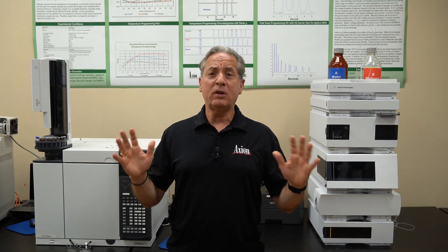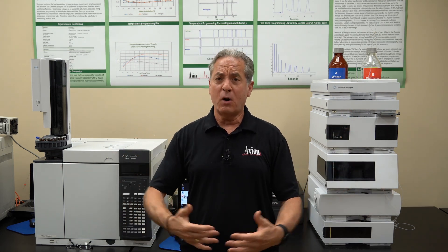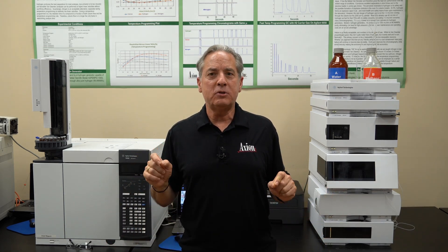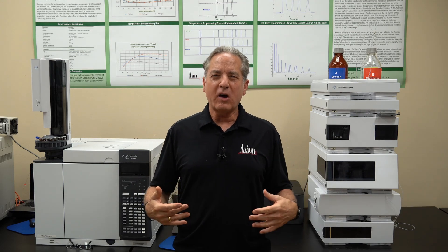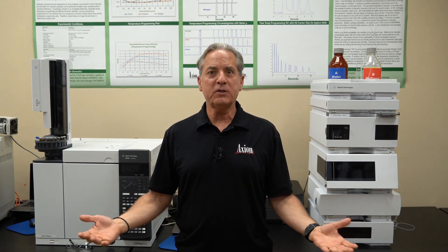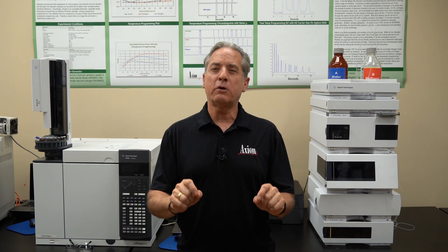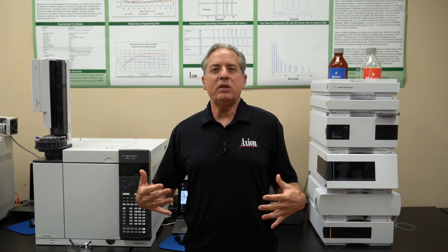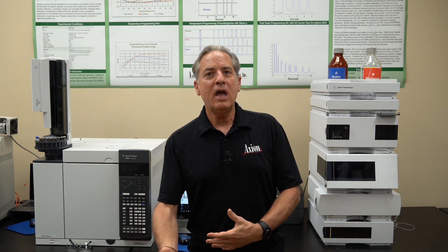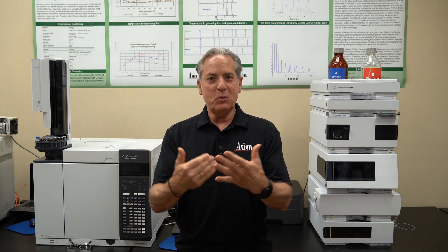We will teach you how to operate the equipment. We have nine HPLCs and 15 GCs that you're going to operate, take apart, and put back together during the week. While you're operating them, we're going to teach you what all the buttons and knobs do — sort of like driving a car, where every control is there for a reason. As you operate the equipment, you'll learn how to make the analysis faster, how to turn up the sensitivity, and how to get a better separation — all just by doing the labs and pushing the buttons.